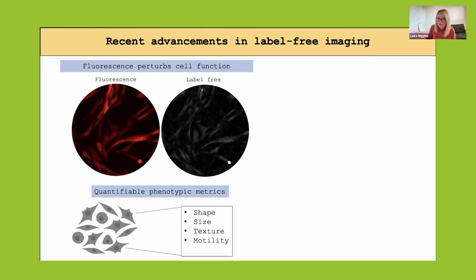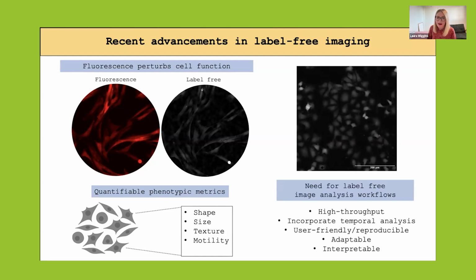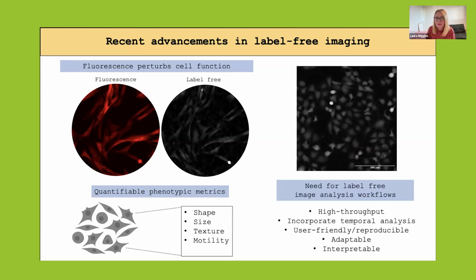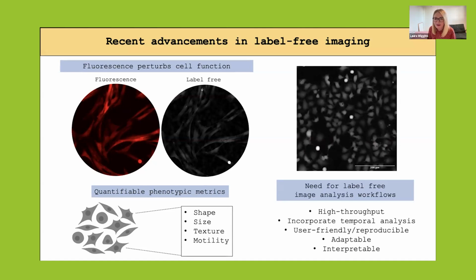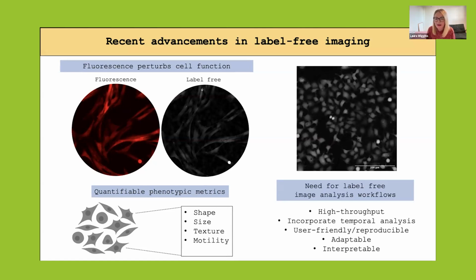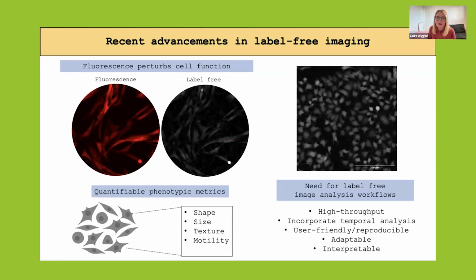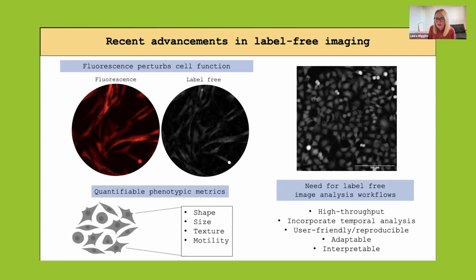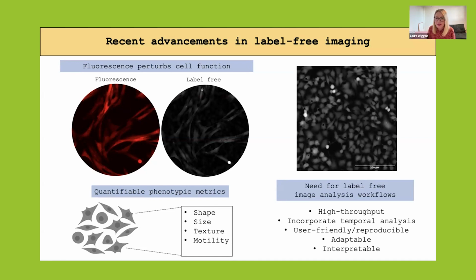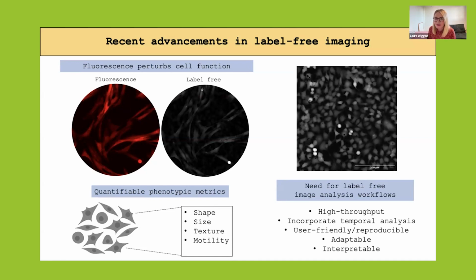So that leaves us with the question of how do we go about analysing that to get to the bottom of our biological research questions, or what we're trying to find out from our microscopy images. So that was the background and our motivation for the work that we've gone on to do. So we thought there's a need for label-free image analysis workflows.